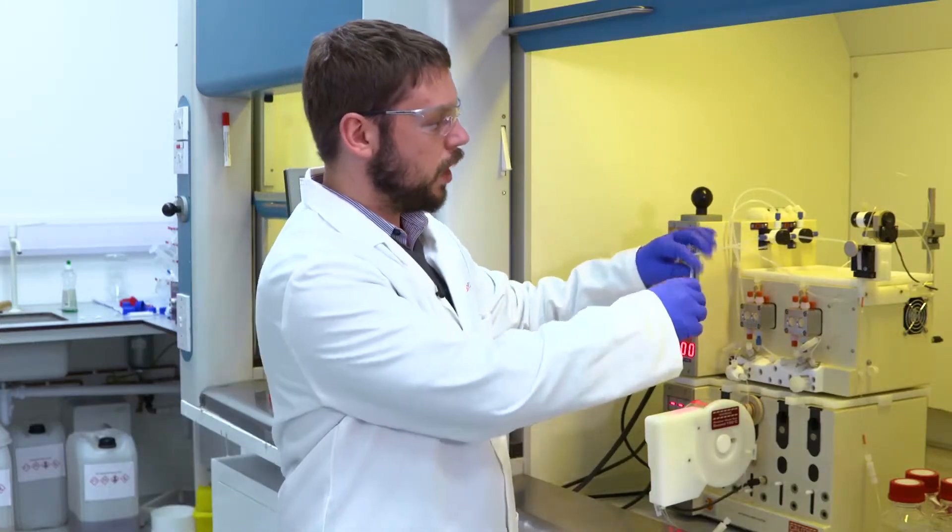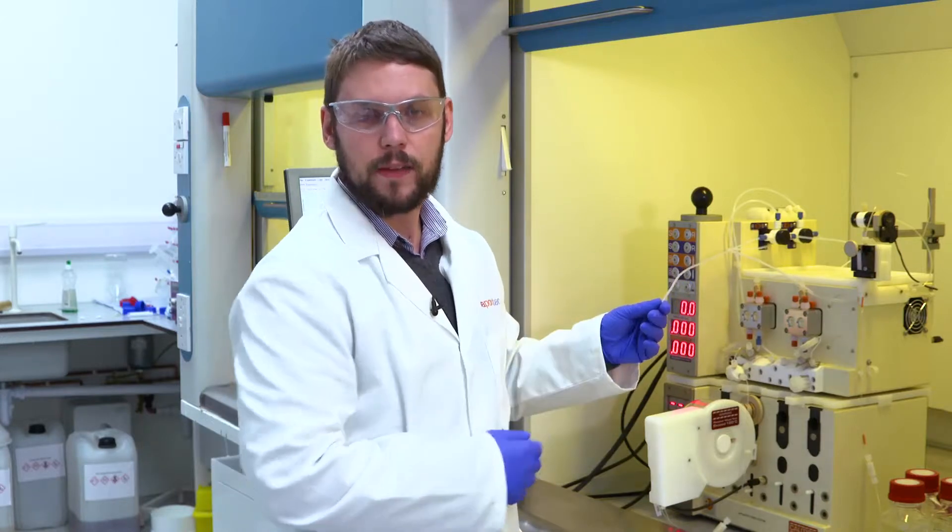Unlike our other pumps this uses large bore aspiration lines so that you don't get cavitation in the lines when you're pumping.